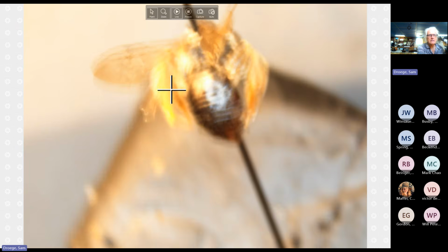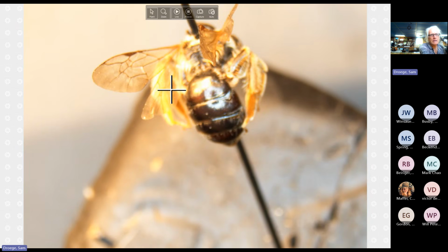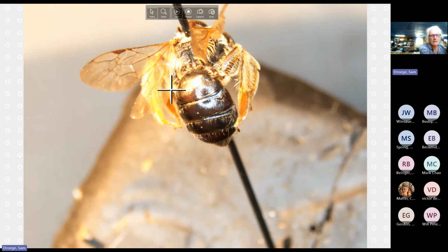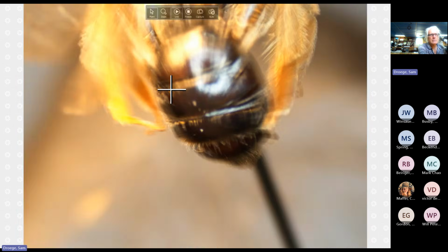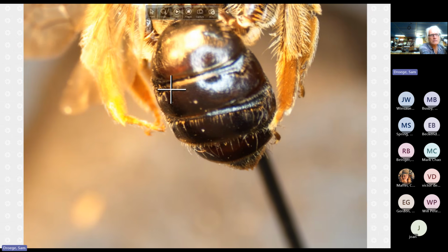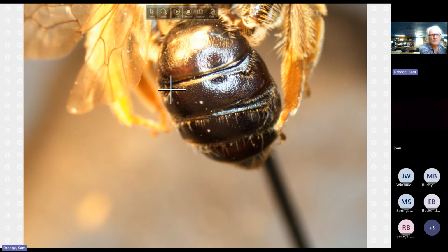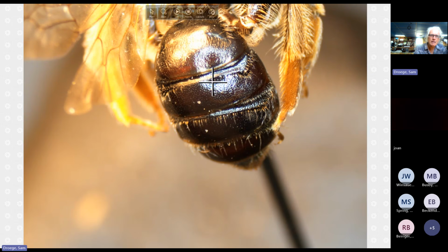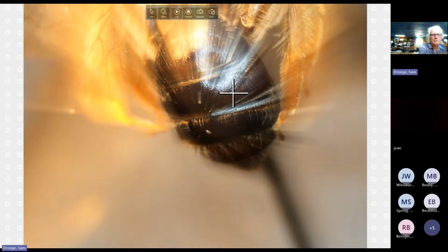We have such a strong character in the scutum pitting density. But let's take a look at the depressed areas on the rim, because we want to look at those. And I'm going to zoom in here because there are so many variations in what could be going on. So what appears to be here, I don't see it well, is that this is part of the depressed rim and is running almost all the way up to the edge of the segment. I'm going to bring in some more magnification here.